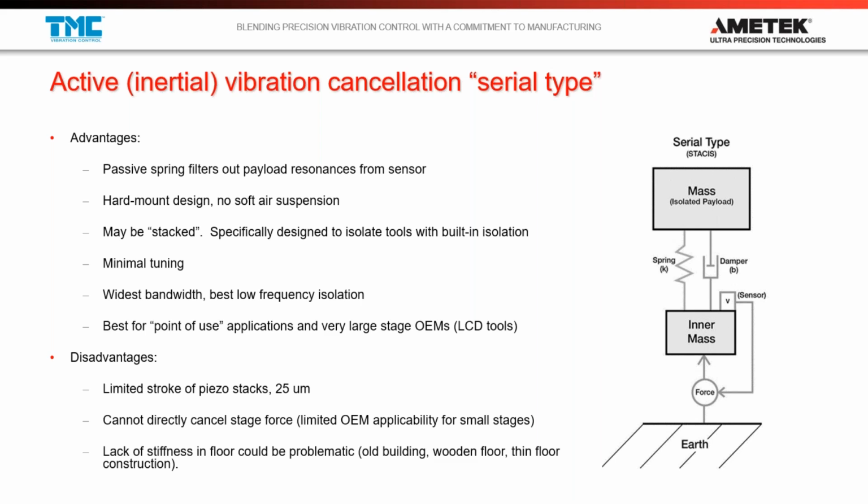And that enables you to provide much better performance in a broadband sense, especially at low frequencies, because you don't have all this extra information from the payload going into the sensor, and you're free to tune your system to really focus on low frequency floor vibration cancellation. Another advantage is that because we have this second stage of isolation in the passive spring, we can put any other isolation system on top of it, which I'll talk about in a later slide when I talk about combining isolation systems.